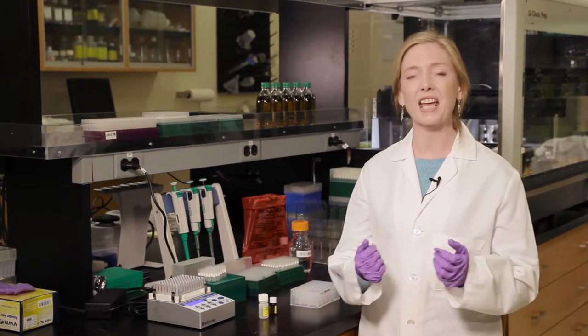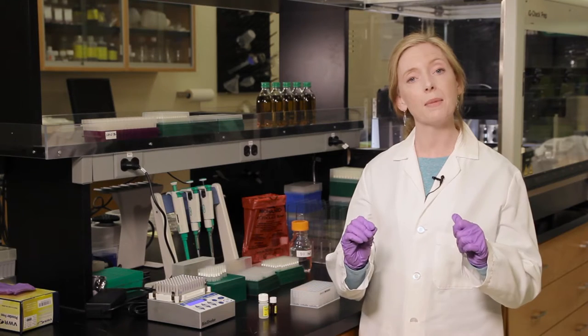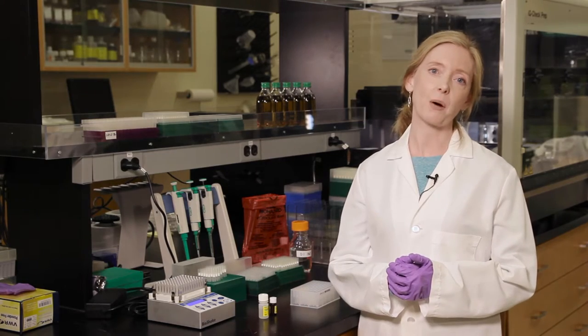Our scientists developed a safe, simple, cost-effective method to remove this free DNA without affecting the living cells and without the use of toxic PMA, EMA, or UV light. We call it the Free DNA Removal Solution. Here's how it works.